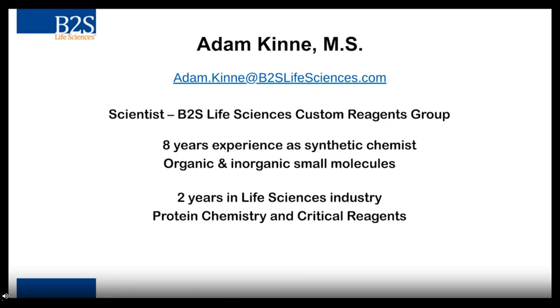What I want to do now is turn it over to Adam Kinne, who's going to offer a couple of very good case studies where the Uncle instrument has proved to be highly valuable in being able to make time-efficient, data-driven decisions about our customers' projects.